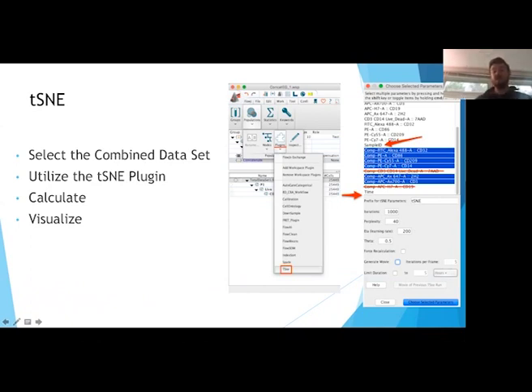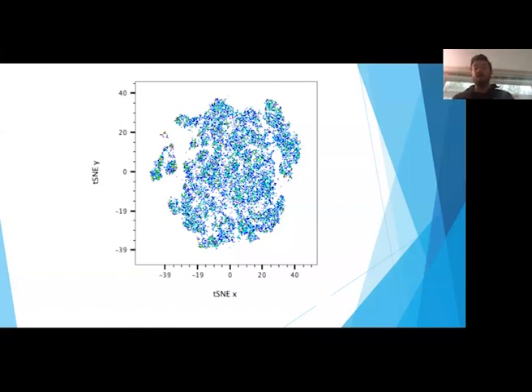So we've obviously completed the calculation for tSNE here, and I'm just visualizing my two new parameters created from those calculations, tSNE-X and tSNE-Y. And I'm showing this in the layout editor, so I've slightly modified the name. By default, it's going to tell you your iterations and perplexity and the other settings you had for tSNE within the parameter names.